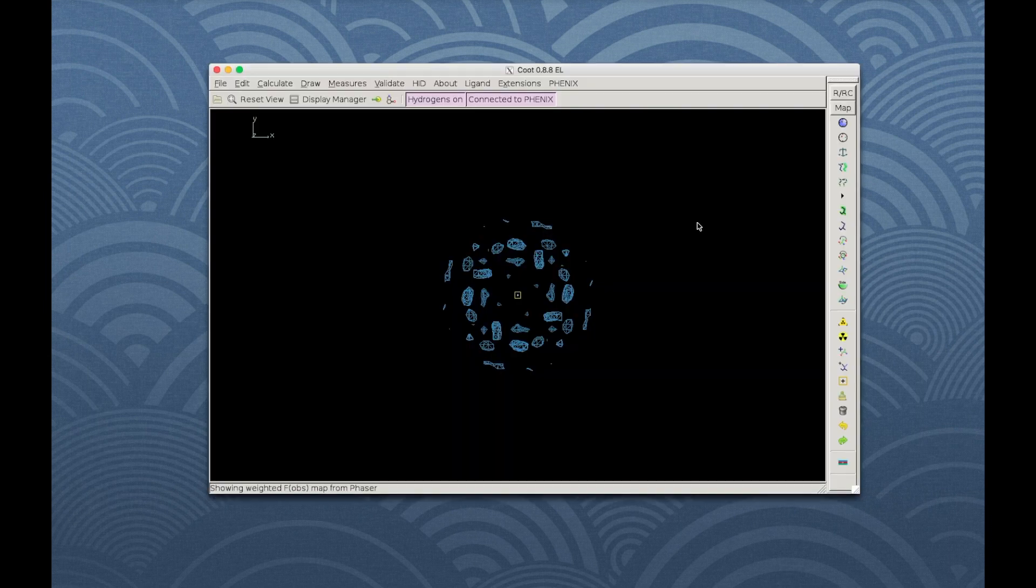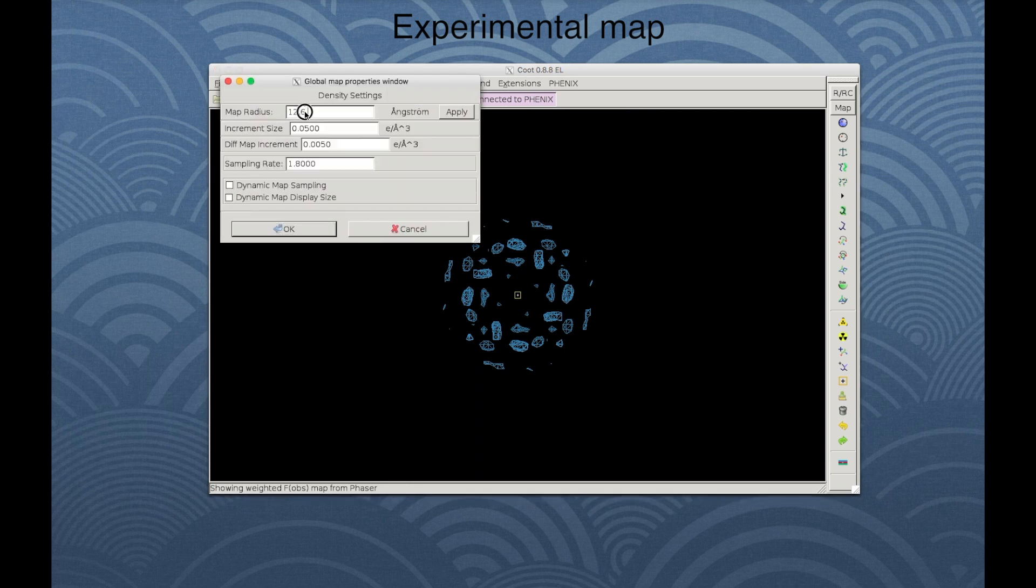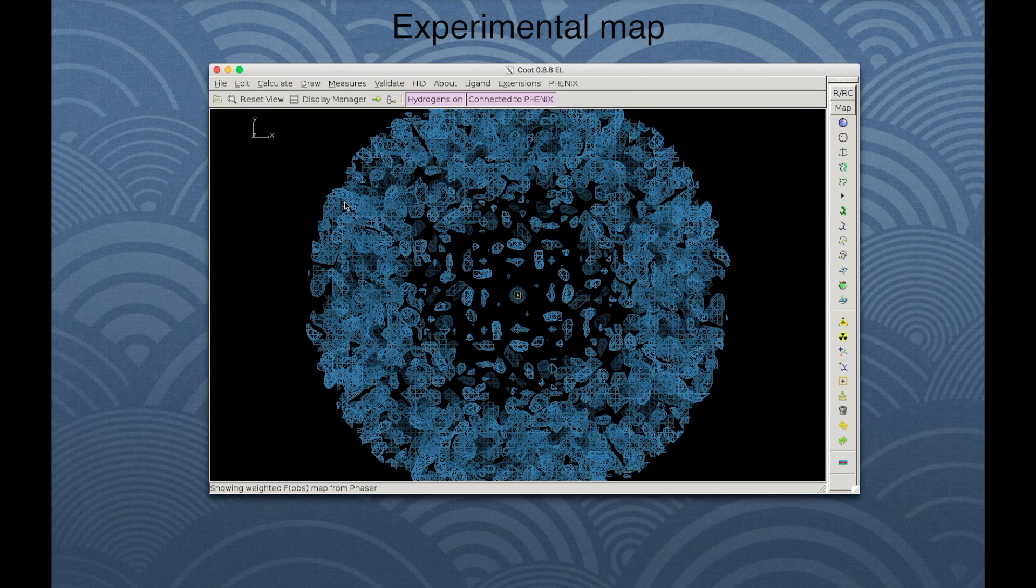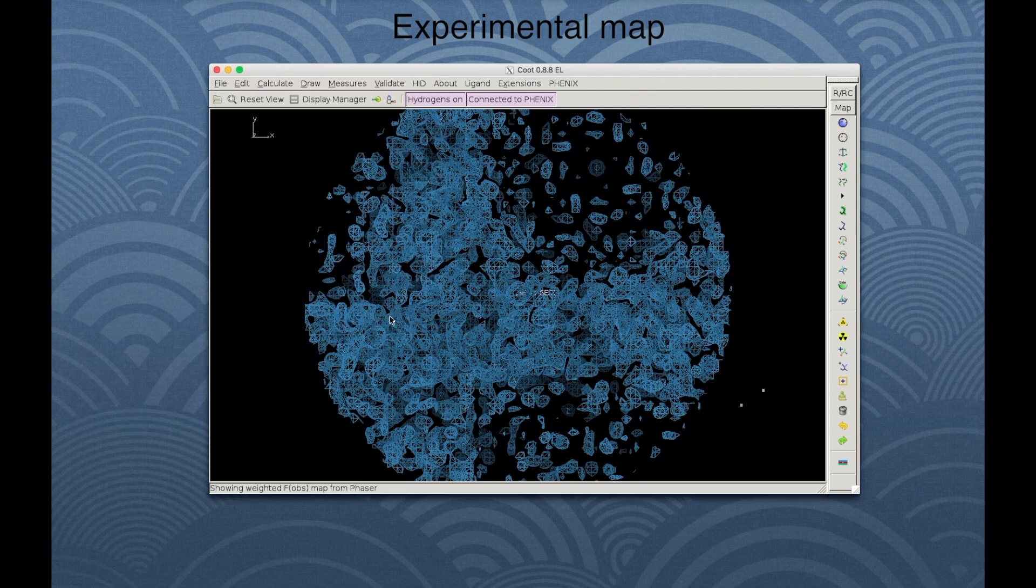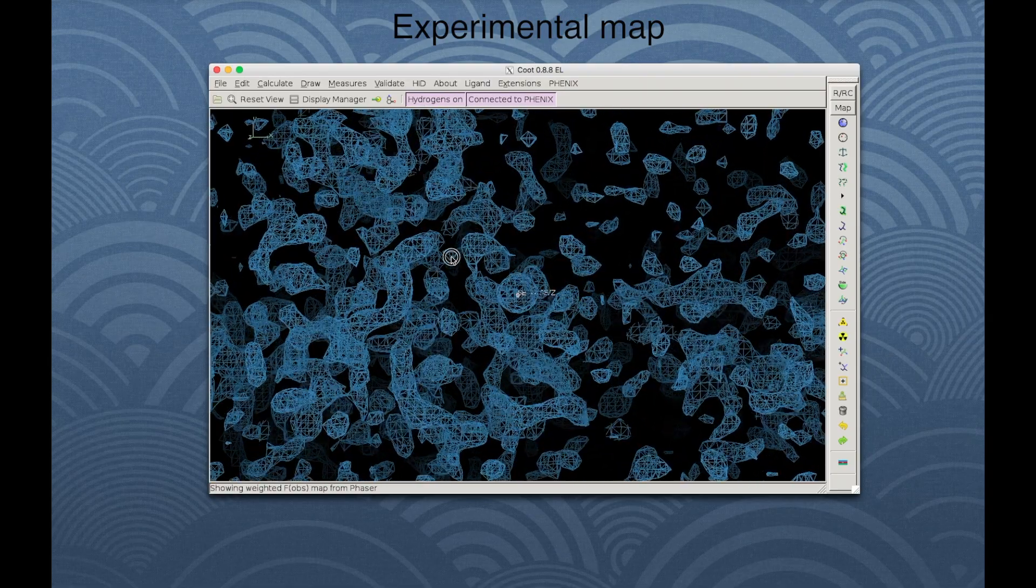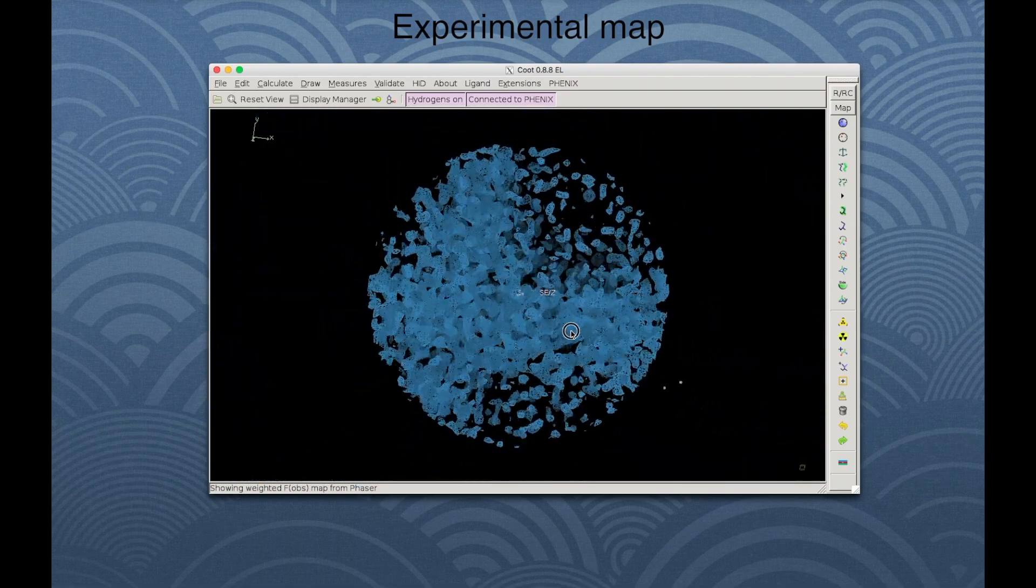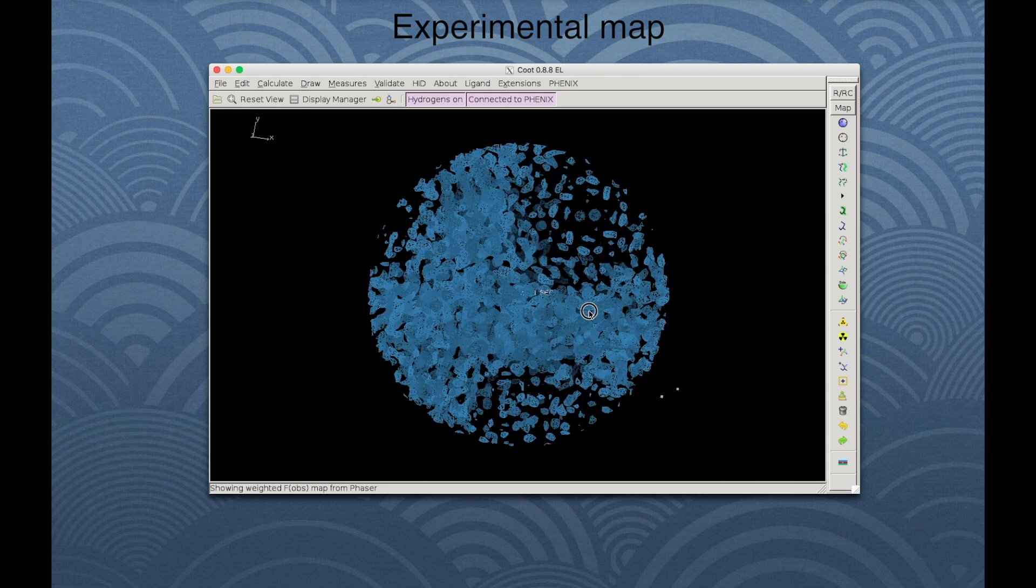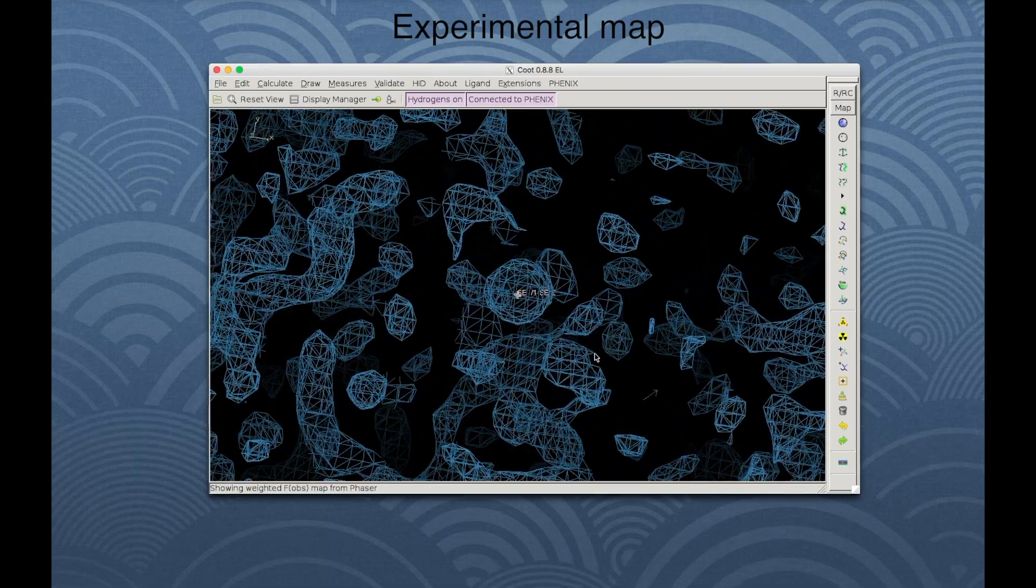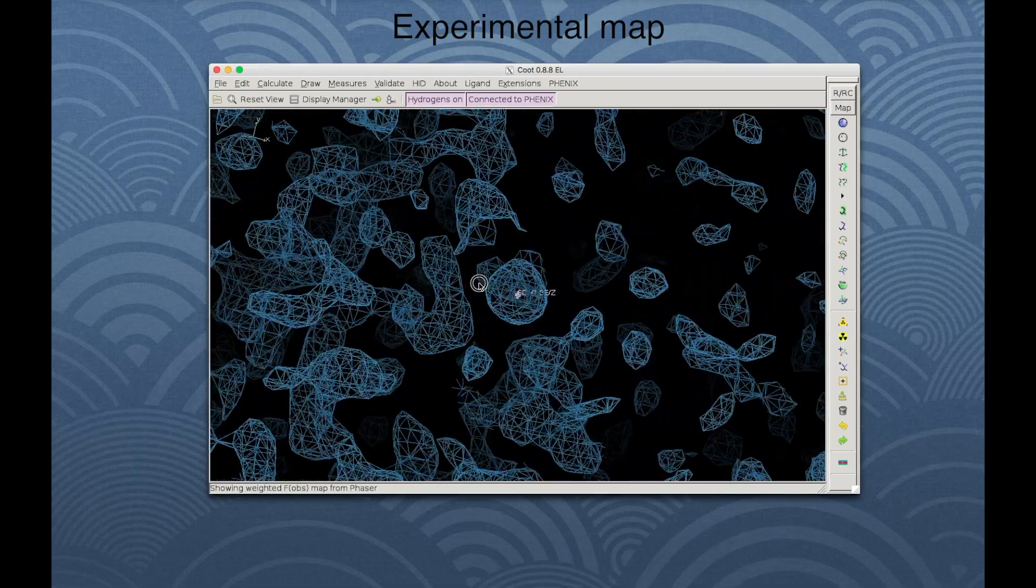A Coot window opens, showing the map before density modification. Go to Edit, choose Map Parameters and set the map radius to 35 to see more of the map. Go to Draw and then go to Atom. Click Chain Z and then click on the first atom in the list to zoom in on one of the selenium sites. Now the view is centered near this atom. Notice that the map has regions that are mostly empty, the solvent, and regions that have more density, which are protein. If we zoom in, we can see some density representing protein chain, but it is not very clear.